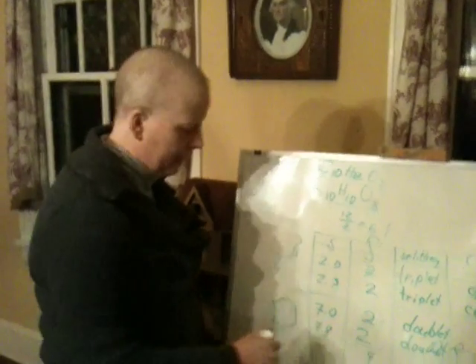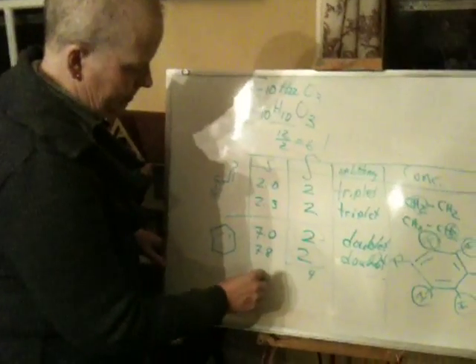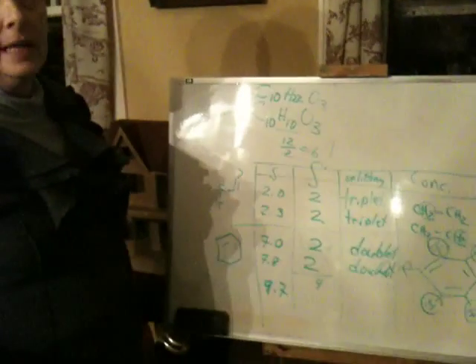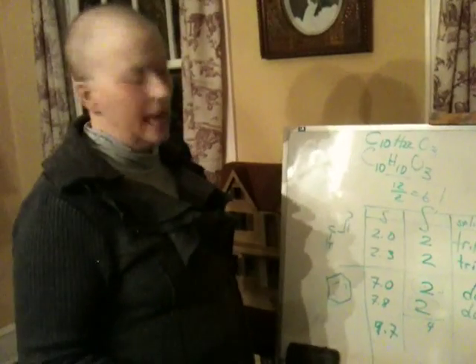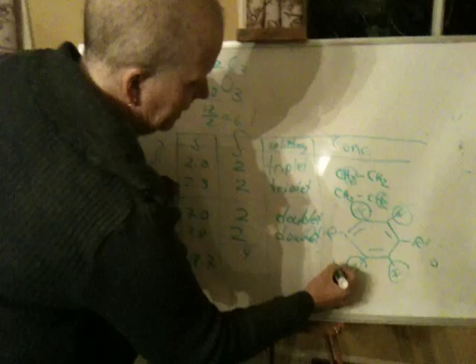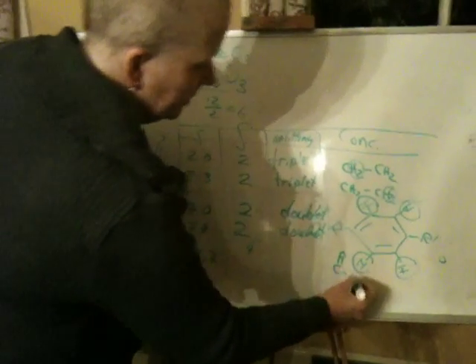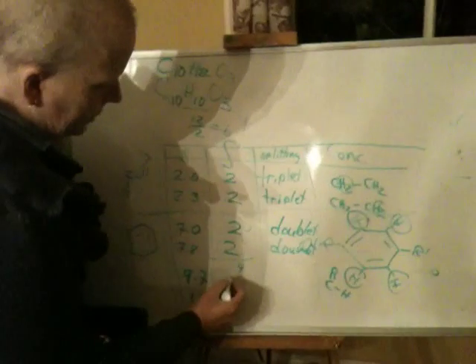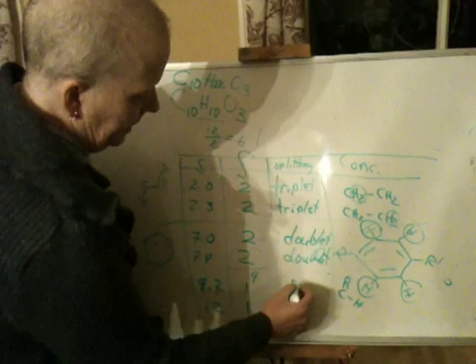All right, let's look at these other 2 peaks. There was a peak at about 9.7 or so, okay? This is one you'd pull right off a table. It's also one that I gave you in class. I told you this peak is consistent with an aldehyde, okay? And then this other peak is kind of interesting. This peak at 12, which again, these are area of 1, singlet.